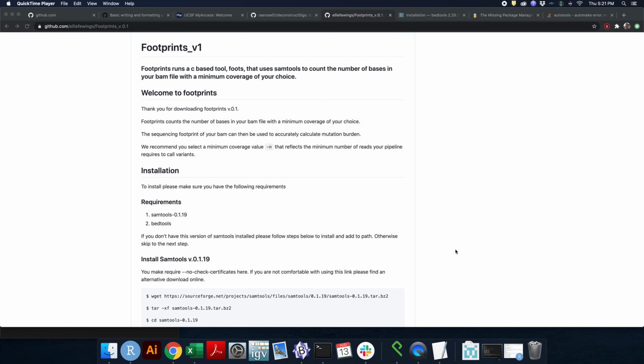Hello, my name is Darwin Shang, and today I'll be showing you how to install and run Footprints on your computer.